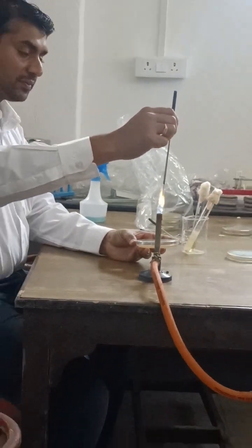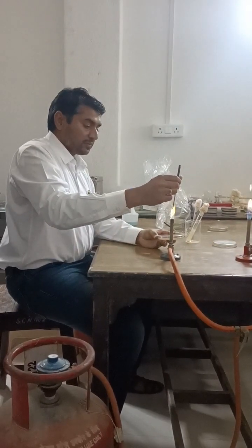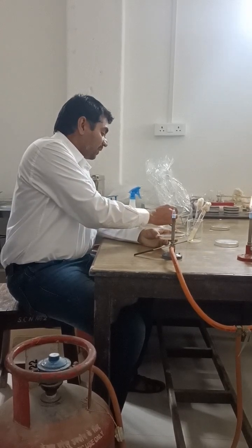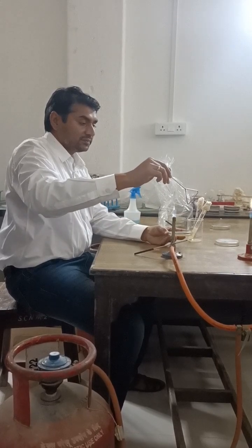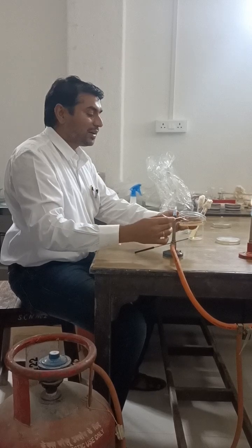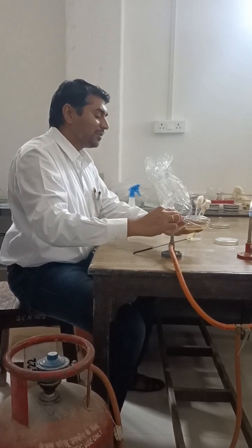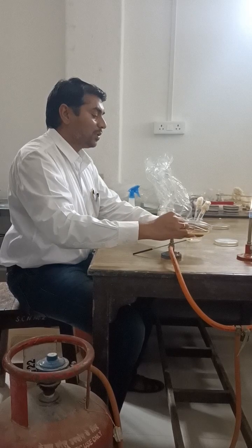Flame the wire loop so that it will not infect anyone — sometimes we deal with pathogenic microorganisms. Then, using alcohol and flame, incinerate the spreader to kill any microbes present on it. Cool the spreader at one corner of the plate.